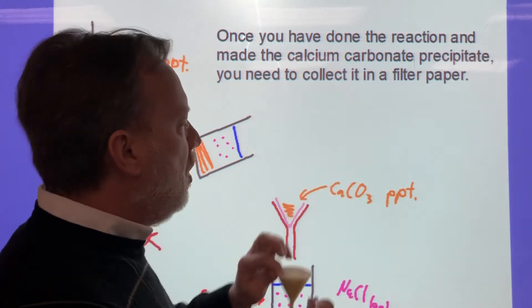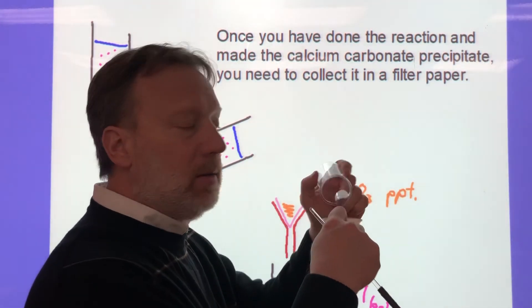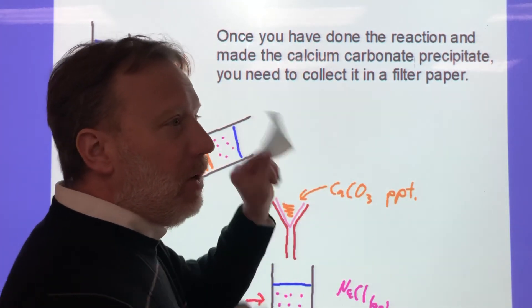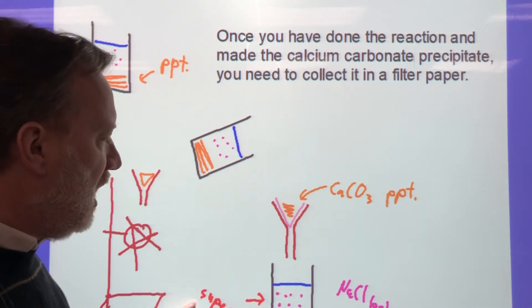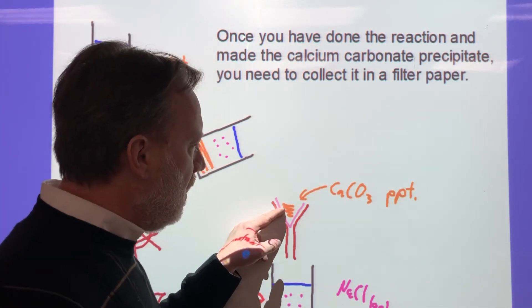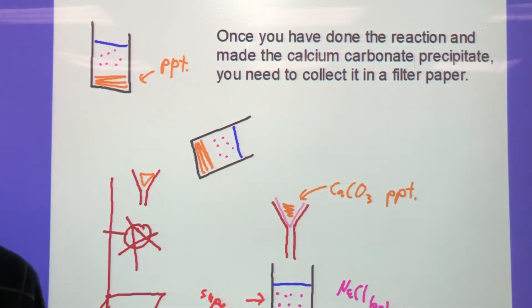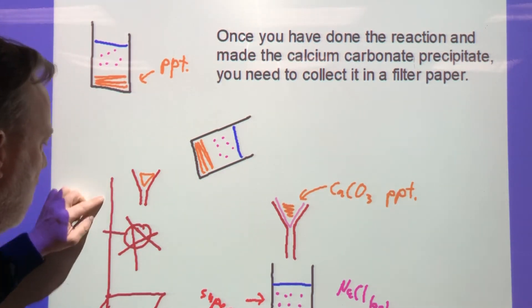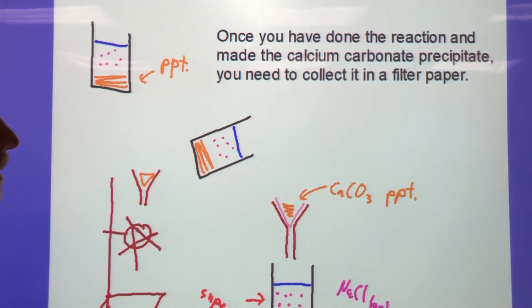Try to keep the gel intact when pouring. When you've gotten out as much as you can, you can use a rubber policeman to scrape a little more into the funnel. The filter paper was already weighed at the very beginning of the lab. The precipitate collects in the filter paper; the liquid that pours off is called the supernatant — it contains your spectator ions. Use a ring stand with a ring and a ceramic triangle to hold the funnel, and place a beaker underneath to collect the supernatant, which you'll discard. This calcium carbonate in the filter paper is your chemically manufactured chalk dust.